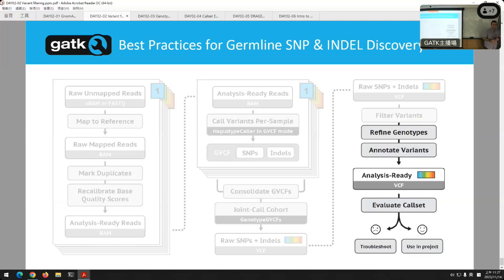Oh, so it could be in maybe one sample, but it's definitely not in general. Show me and we can look at it afterwards. I think the 2D model is definitely more accurate, and you can learn a lot more features from it. But it also is really slow, really, really painfully slow. So we don't really use it much. Good. Other questions?